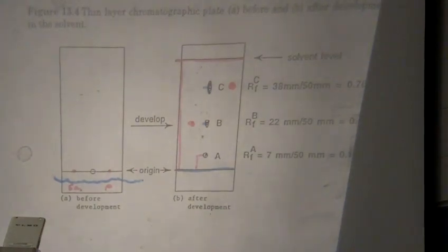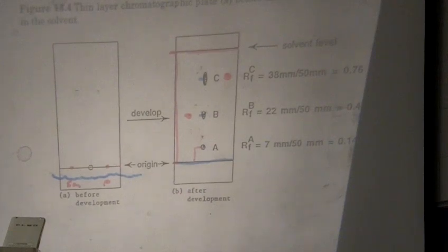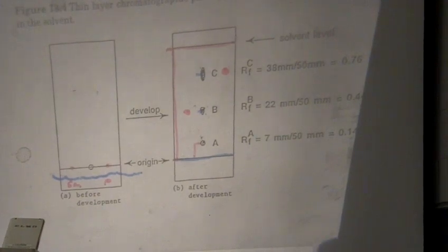There's multiple ways you can visualize what's going on with a TLC plate. We are going to use UV light. Now, what do you know about aromatic compounds and UV activity? Are they active or not? They are UV active, so that's how we can see them. It's kind of a key with our dienophile that it has that aromatic ring on it. That's what makes it so we can see it as a reactant and see it as the product. We've got that aromatic ring all the way through to be able to visualize it.